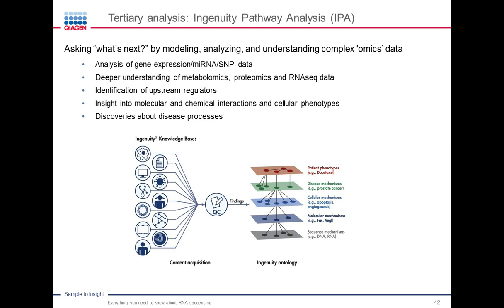Okay, so what IPA does is that it collates and collects and quality assures basically all publications and data sets that are deposited into the public database, and it integrates them together and provides you connections to all of your papers. Okay, so instead of manually looking paper by paper, if you upload your data set, it integrates this into the IPA set and basically weaves it into what already exists and what is known for the data sets.